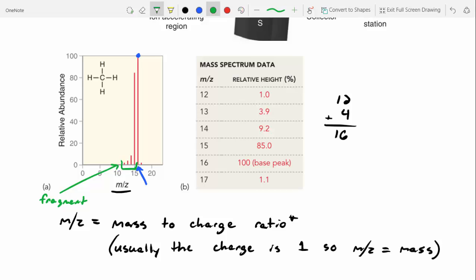Mass specs will even pick up isotopic abundance of different elements as they fly through your mass spec. In this one, you can clearly see that we've got a sample with a little bit of carbon 13 down there, and it's super tiny because carbon 13 only makes up about 1% of all carbon on our planet. It's not very abundant, but you can see it very clearly on mass spec, and it becomes a useful tool, which I'll show you guys later.